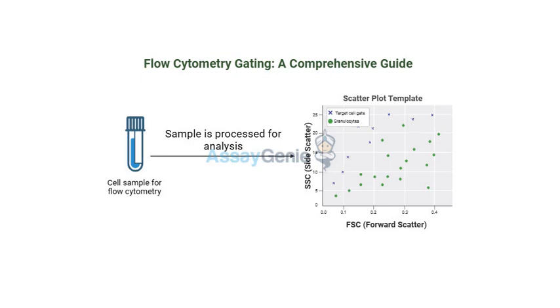Okay, so imagine you're a detective, right? But instead of a crime scene, you're investigating the world of cells, hunting for clues inside individual cells. That's the power of flow cytometry. And today we're going to take a deep dive into flow cytometry gating, the technique that helps us solve those tiny mysteries.